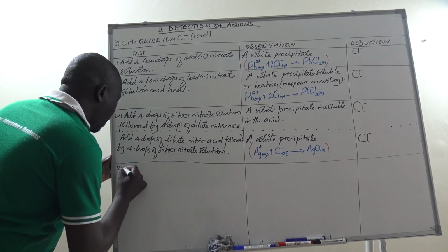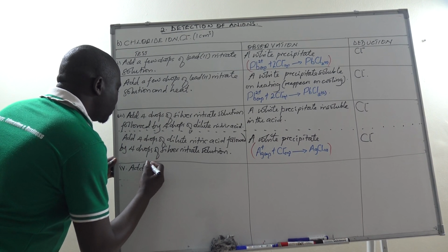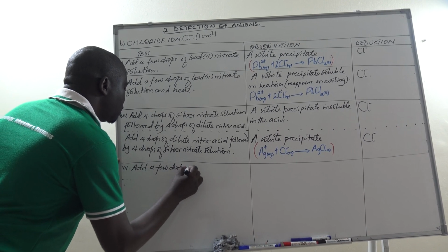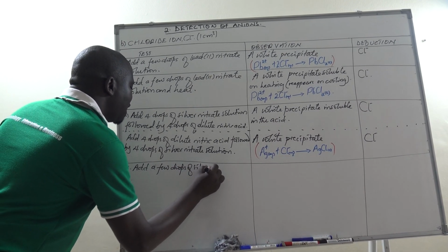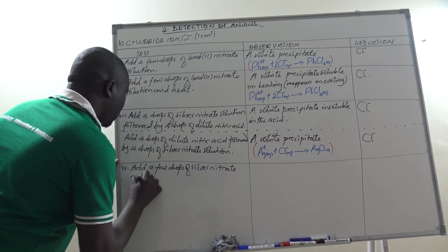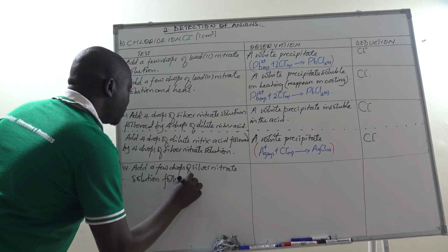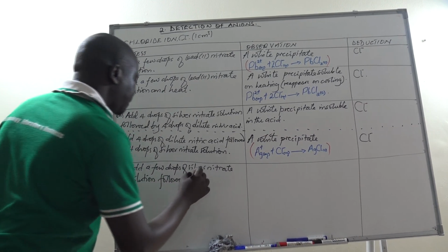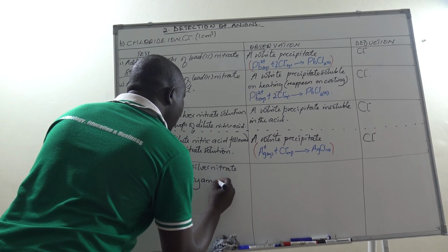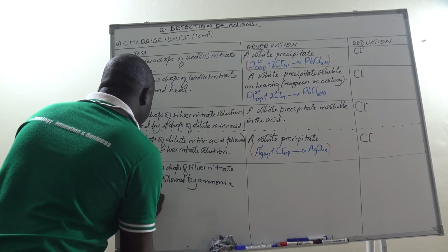So finally, we can also add a few drops of silver nitrate solution followed by ammonia solution.